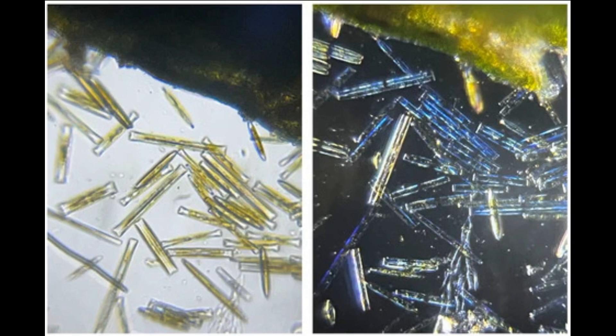This figure shows a brightfield image of diatoms captured with a Foldscope phone and Foldscope LED light. It can be challenging to clearly see structural details of transparent objects using brightfield viewing. This is because there's very little contrast between the object and the background.